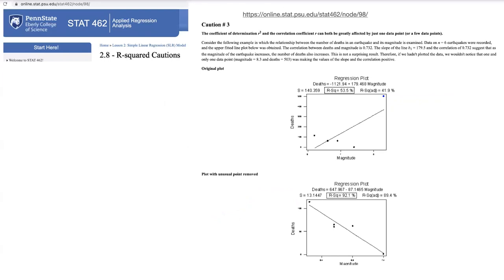So maybe you were pipetting and your pipette missed the sample because you weren't looking and you didn't see that it hadn't actually sucked up the liquid. So it's really important when you're doing the small pipettings with something like a qPCR, say, that you're making sure that when you're pipetting, you're getting the right amount of liquid into your pipette and out of your pipette. If you mess up, you might get an outlier point. Now, you don't want to just be going through your data and removing the points that you decide are outliers because you don't like them. But you can remove the ones that are clearly wrong.